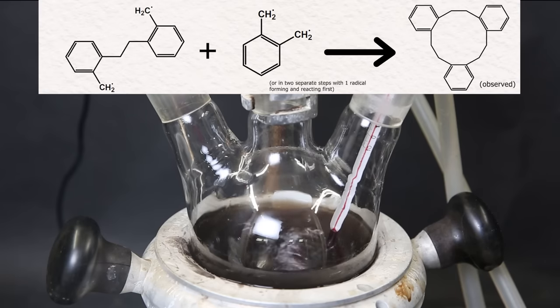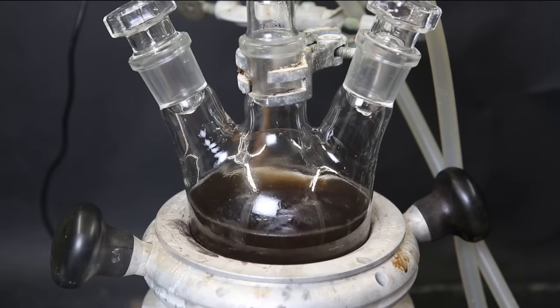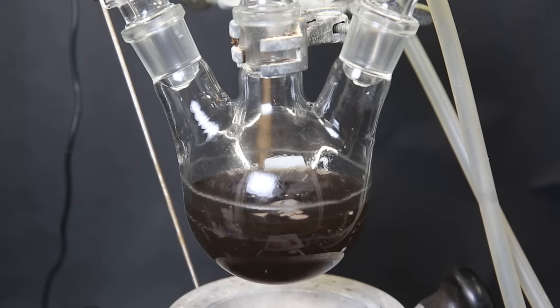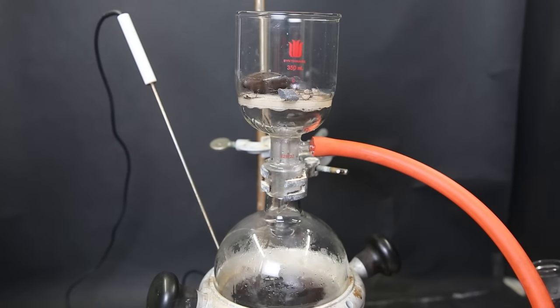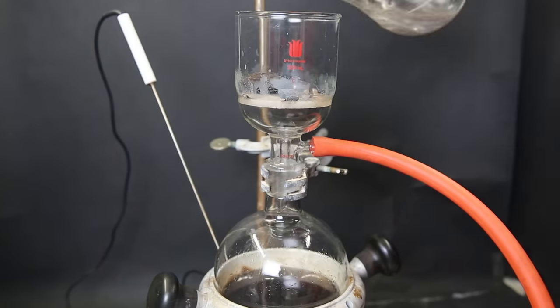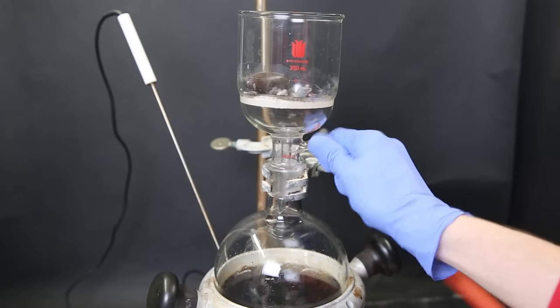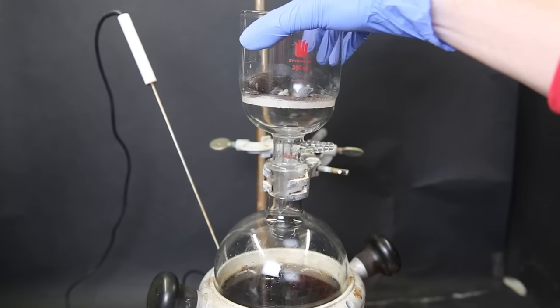Though this is not all that is happening. Either in multiple steps or at once, depending on where the radical forms and when it reacts, the intermediate molecule can also react with another uncoupled radical and form the triple-coupled product. So I added the solution during 1.5 hours, and afterwards let the mixture reflux overnight to make sure everything reacts. When that is done, I take it off heat, and we can see most of the lithium has reacted away. To remove the remaining lithium pieces, I filter the mixture with vacuum filtration into another flask. I then wash the flask and the pieces on the filter with some THF. After that, I remove the filter and discard the lithium pieces.